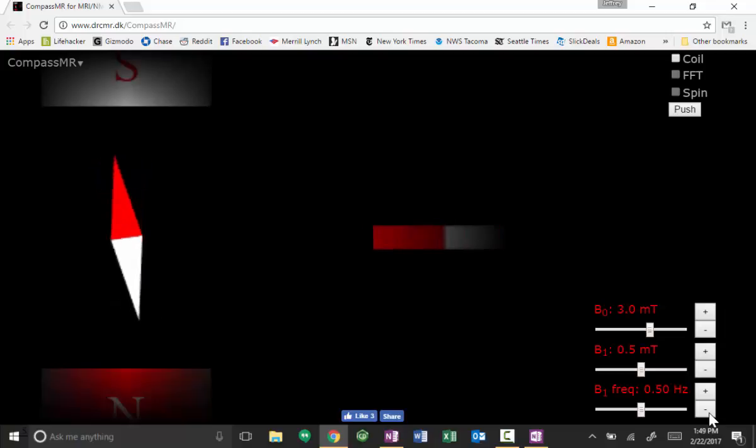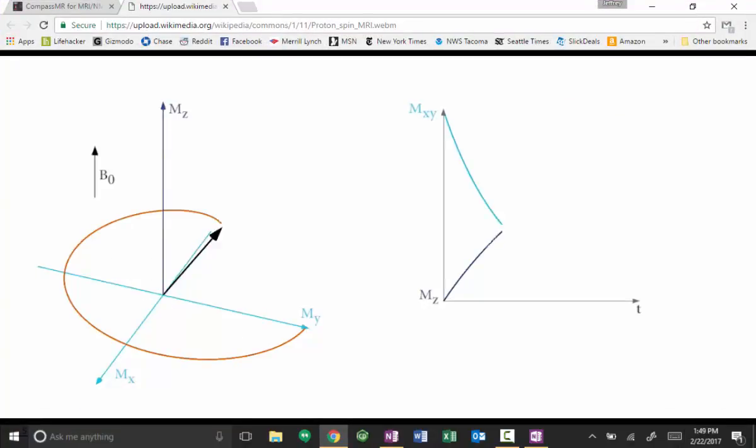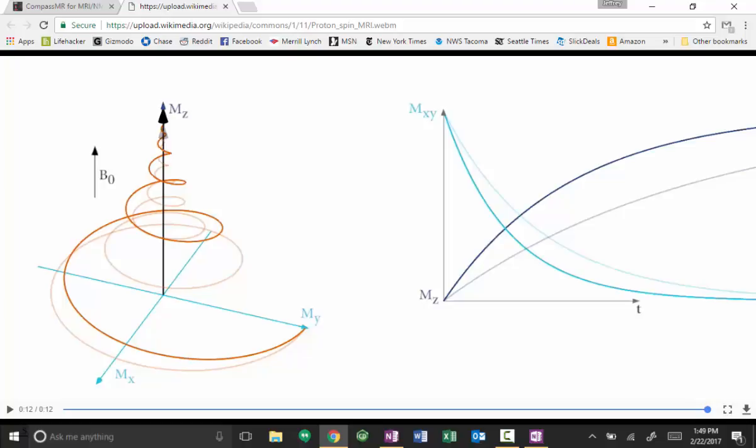It's a little bit abstract, but let's think about it too in terms of a spinning sphere. So you can imagine a spinning sphere will actually try to whip back into that magnetic field as soon as that frequency stops being applied. So you can imagine that horizontal frequency knocking it off axis, right? It's going to be wobbling off to the side, and then as soon as you stop, it's going to relax back into that magnetic field.